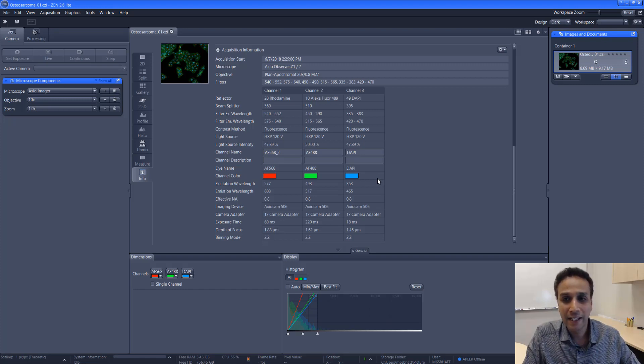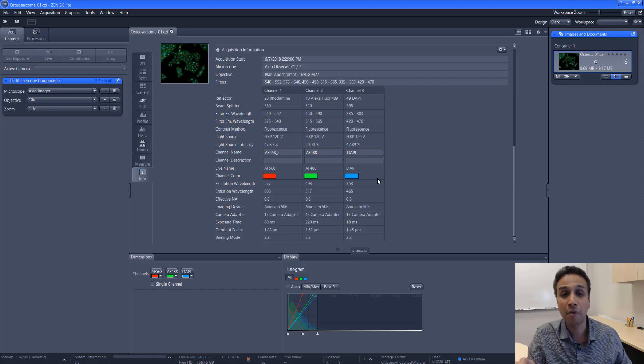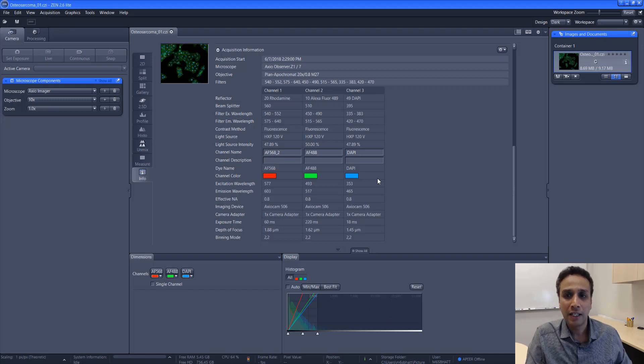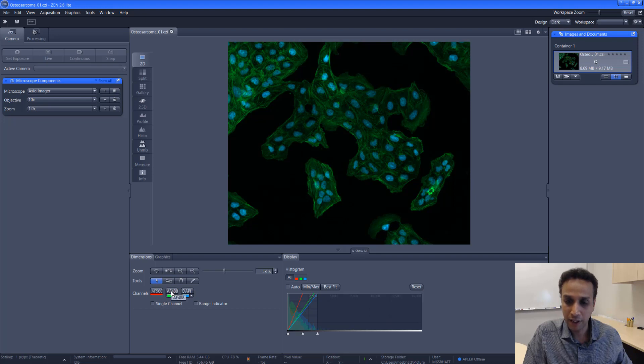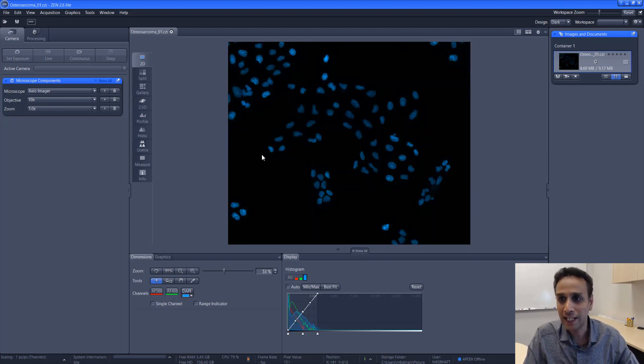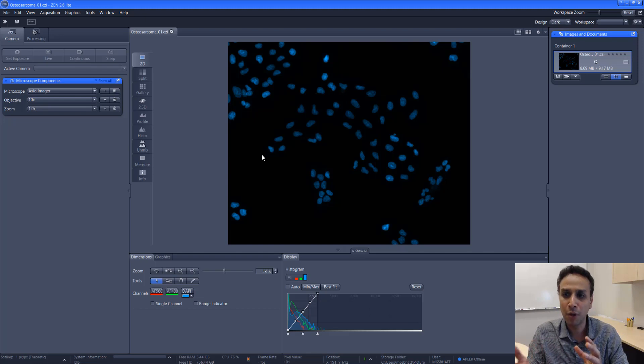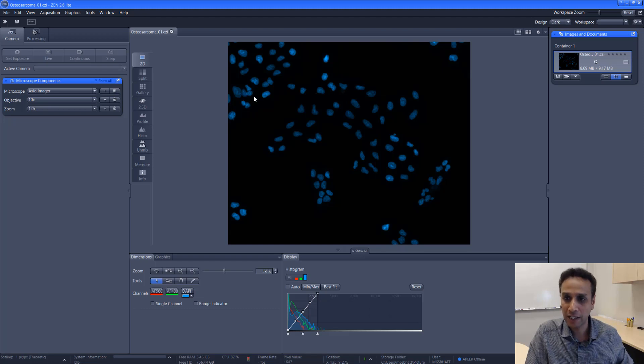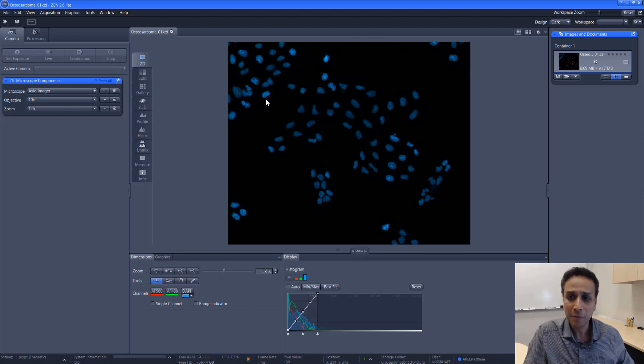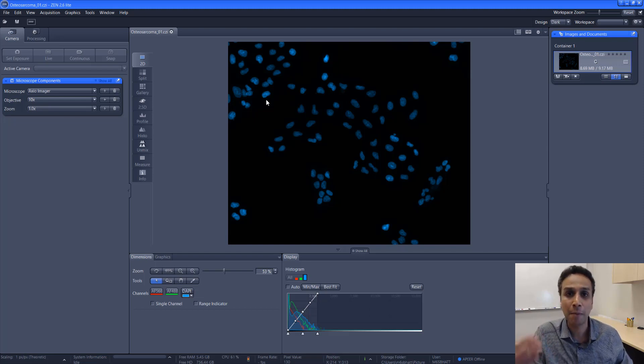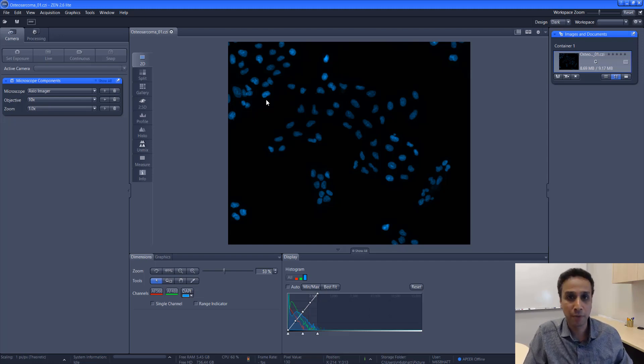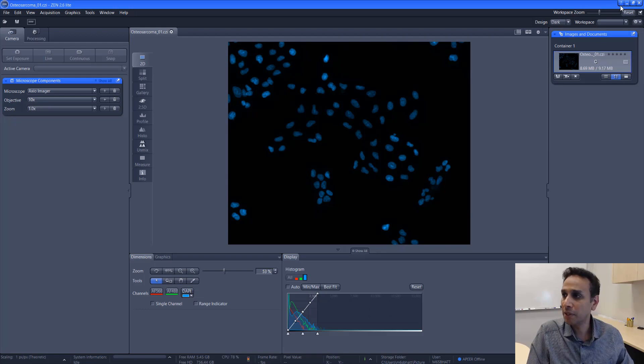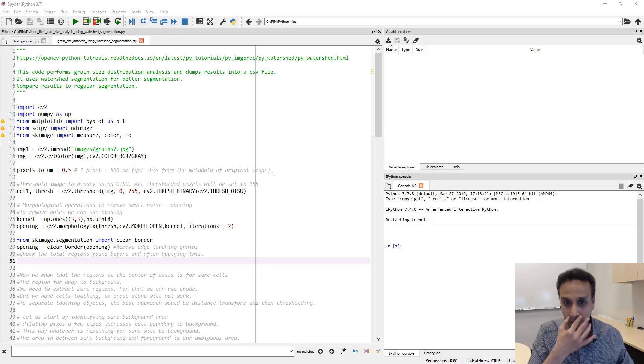It actually is a good way of separating nuclei. If I turn off the red and green channels and only look at the blue, you see that it's almost like it's already a segmented image. We just need to threshold them, segment them, separate them, and then just count them. That's why in life sciences it's very important to actually get the sample preparation done right, then the imaging problem will be very simple to solve.